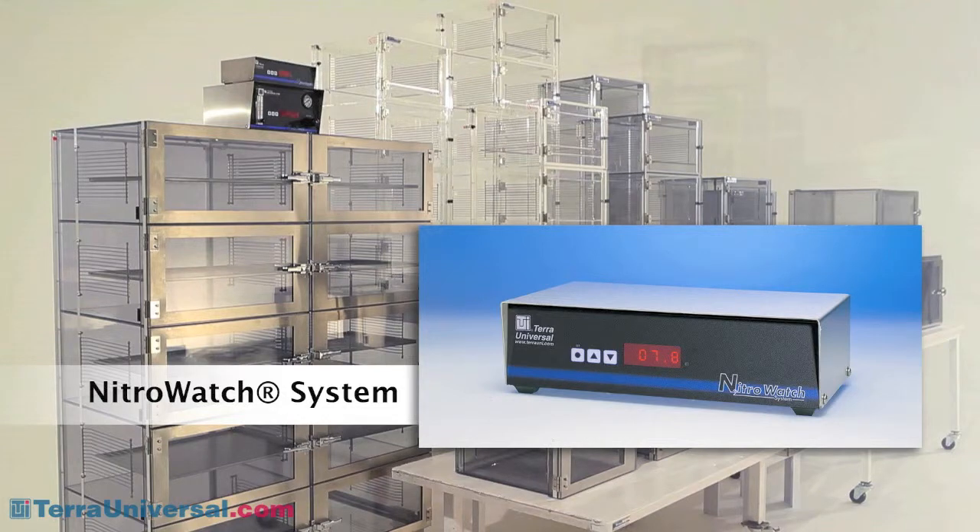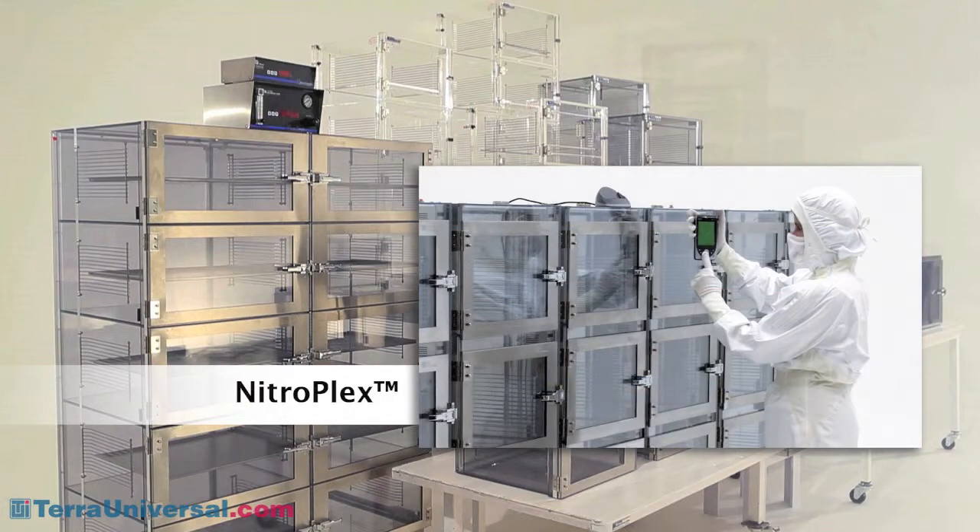A NitroWatch controller adds humidity sensing and RH control capabilities, allowing you to maintain a humidity setpoint automatically. For the most critical RH control requirements, Terra offers a NitroPlex system, which provides independent chamber-by-chamber humidity control.